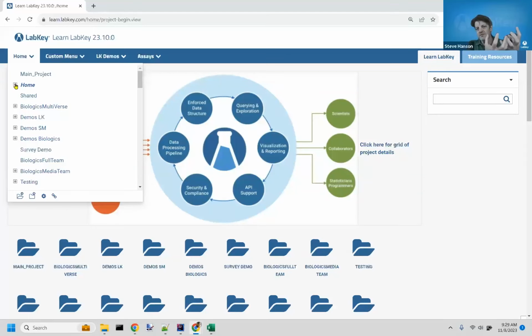They're just containers that you put stuff in. But projects become really important especially for configuration, because when you configure things in a project, you can make those configurations cascade down into the subfolders. And that is a pattern you see over and over again in the server. It takes a while to learn it, to feel the depth of what that means. But for an admin, it's really important to know that.